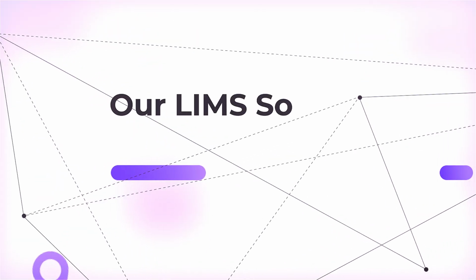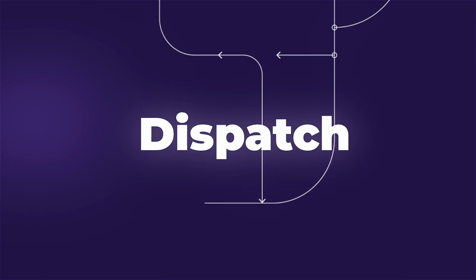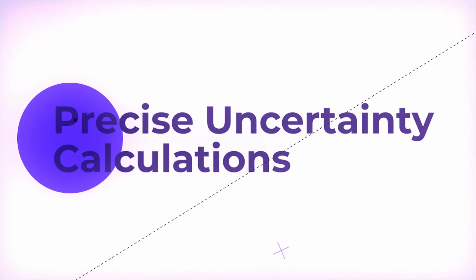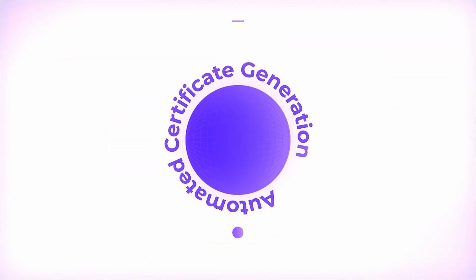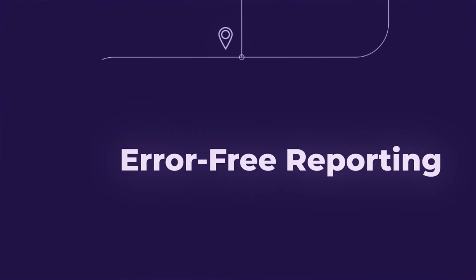Introduction. Our LIMS software is engineered specifically for calibration labs, streamlining the entire workflow from DUC inward to dispatch. Key features include precise uncertainty calculations and automated certificate generation from raw datasheets, ensuring high accuracy and error-free reporting.